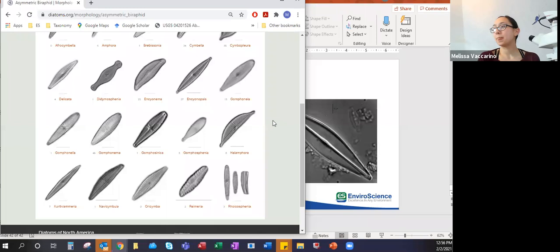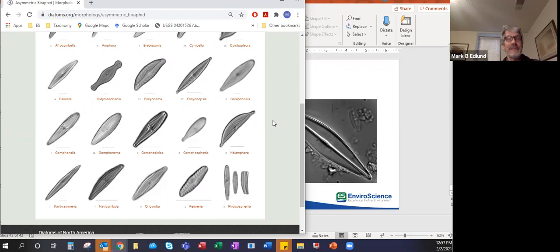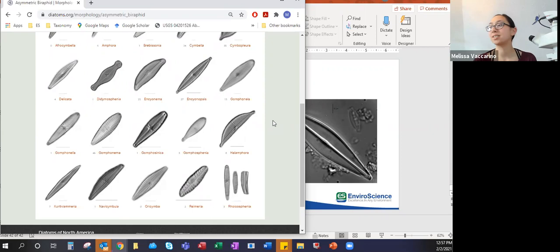Right. So in our case, we got a microscope that was specific to follow the EPA NRSA standard microscope. And so these are high quality, so you can see the striae separations. I can't remember the name of it, but there was a specification where your microscope does have to be a certain quality in order to be able to see some of these striae. I think it's the numerical aperture of the lens. Yes. And remind me, do you normally do all of your analysis with oil immersion? Yes, we use 1000x oil immersion.